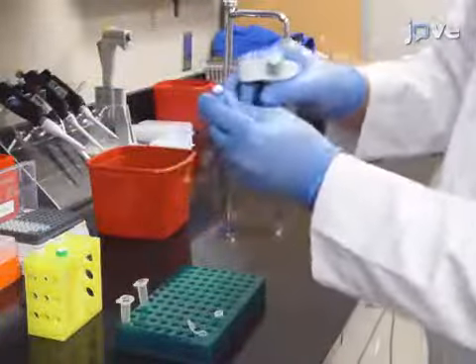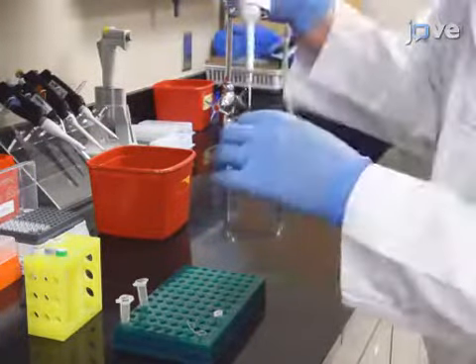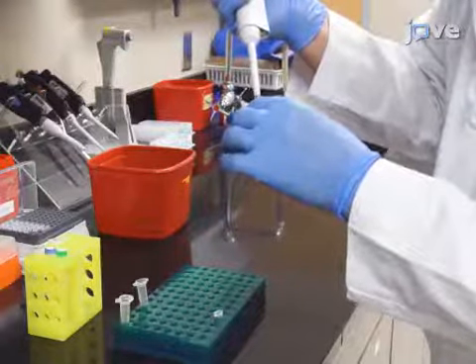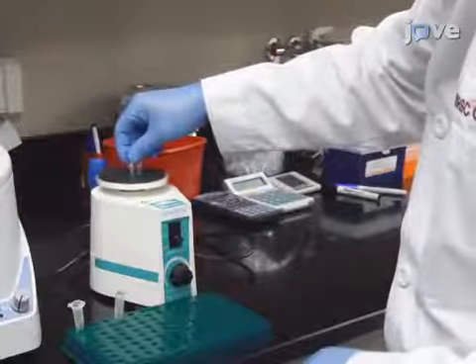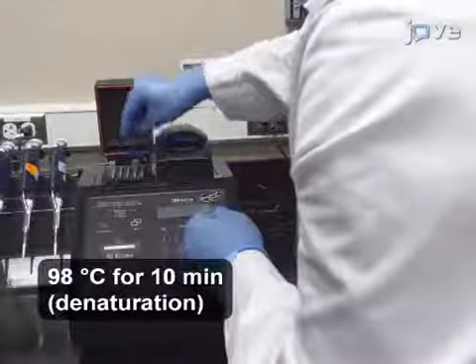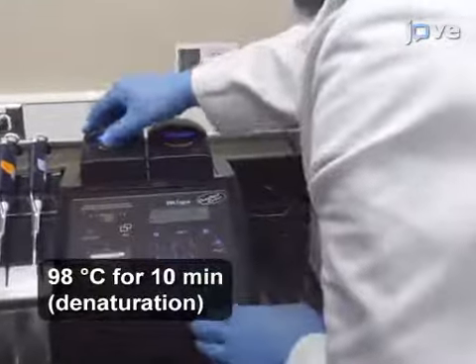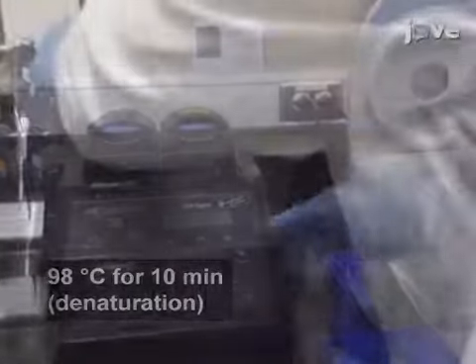Then add 5 microliters of random primer to the centrifuge tubes. Quickly vortex the tubes and after a quick spin-down, place them in a thermocycler for 10 minutes to denature the DNA samples at 98 degrees Celsius. After 10 minutes, remove the tubes from the thermocycler and instantly place them on ice water for 5 minutes.